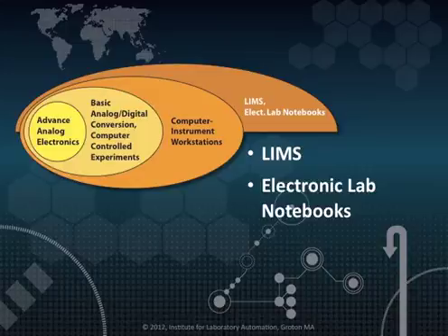modifications. The next section we will consider comes under the heading of Laboratory Informatics. Over the past few years, this is the place where a major amount of emphasis has been placed, where companies are considering laboratory information management systems and electronic laboratory notebooks. We'll start by looking at laboratory information management systems.